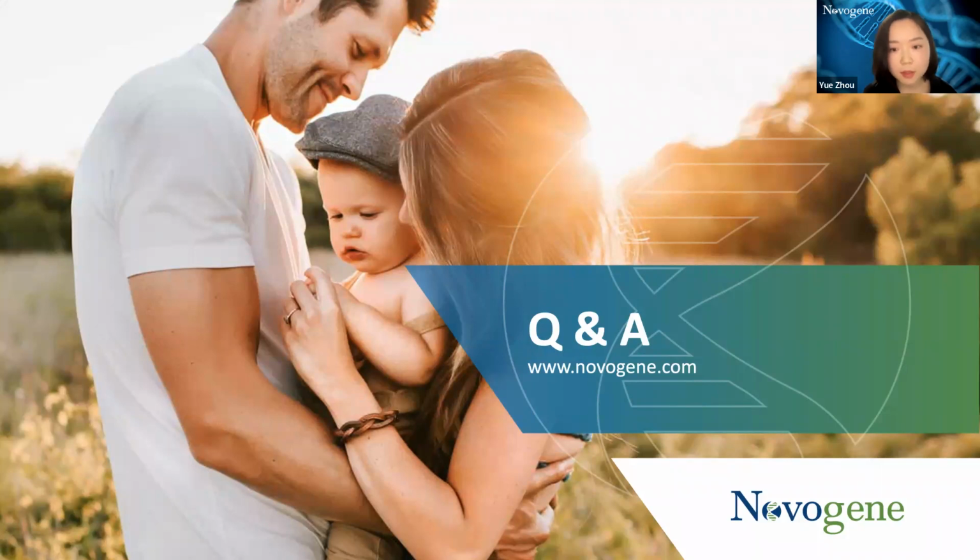Since you were mentioning the UMI tag, I think for UMI tag techniques, you could just remove the duplicates as suggested. Whereas for the majority of RNA-seq, we do not consider duplicates a problem. Yeah, thank you, Aoife. Thank you.